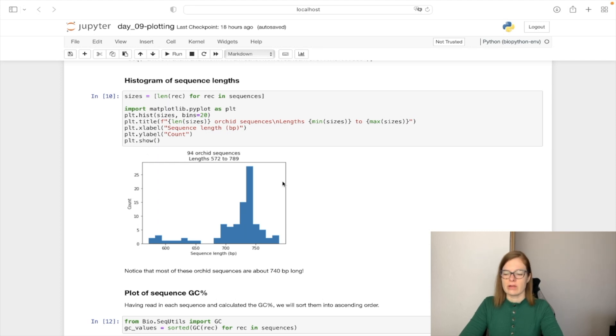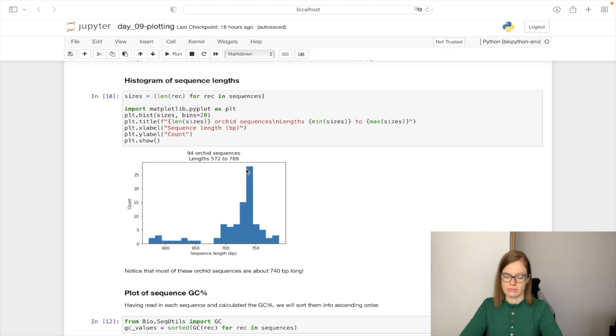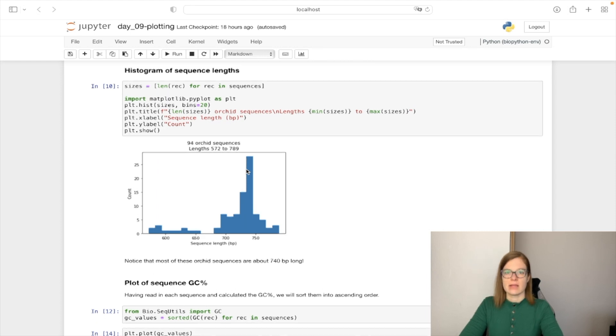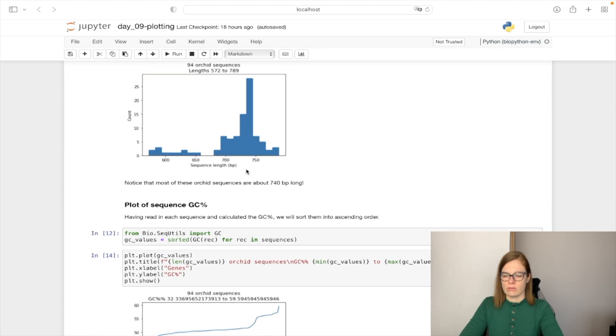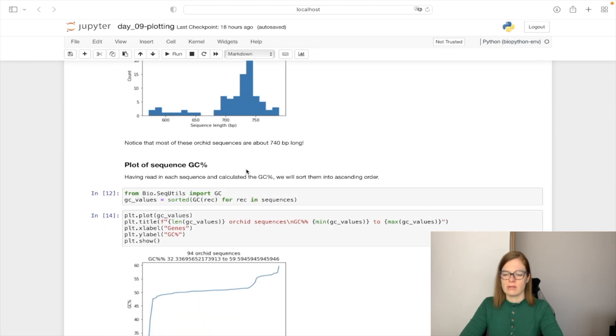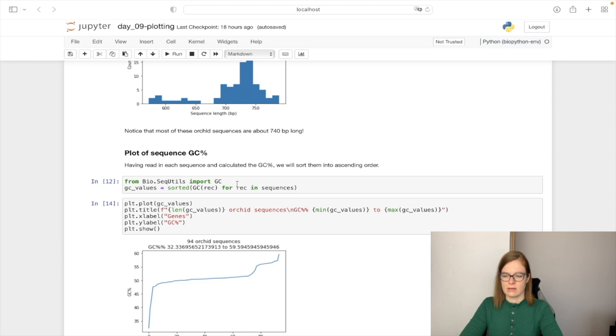And we can notice that most of these Orchid sequences are about 740 base pair long. Next, what we can do is plot the sequence GC content.